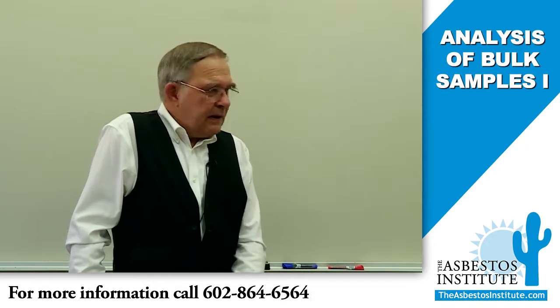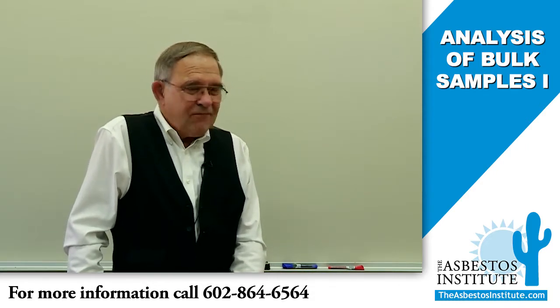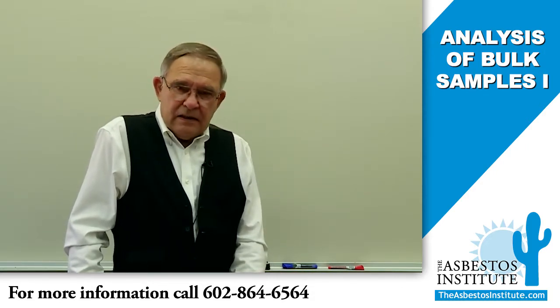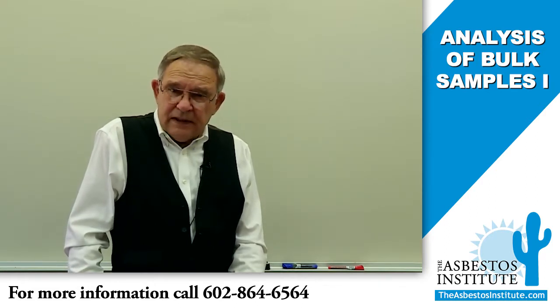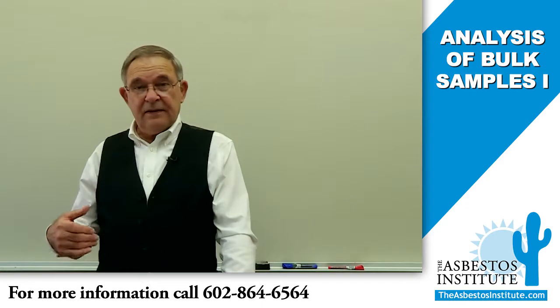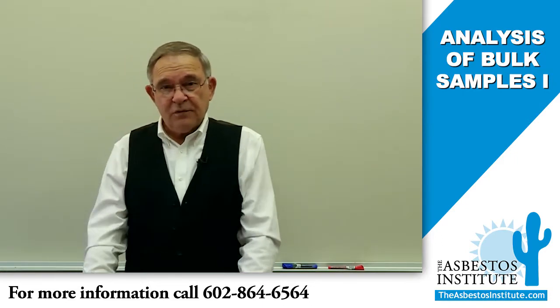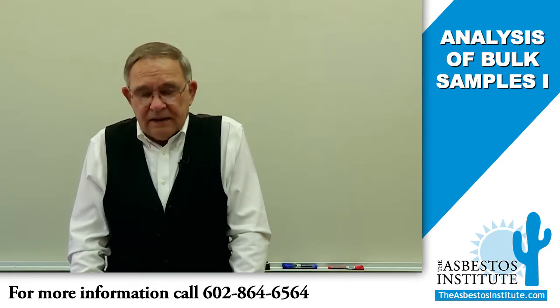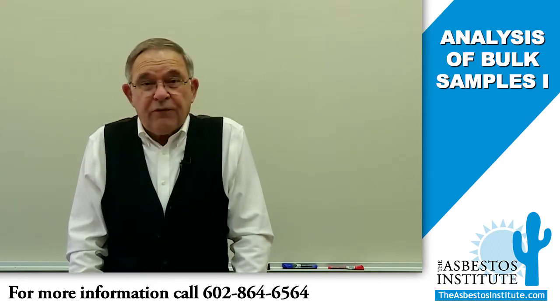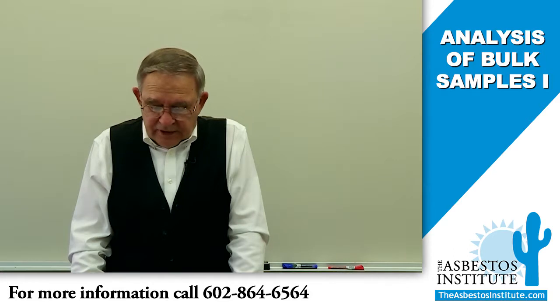Under all of our regulations, EPA, OSHA, all of them, there is a basic analytical method, and it's called PLM, or polarized light microscopy. You understand that because this is a refresher class, not an initial training.